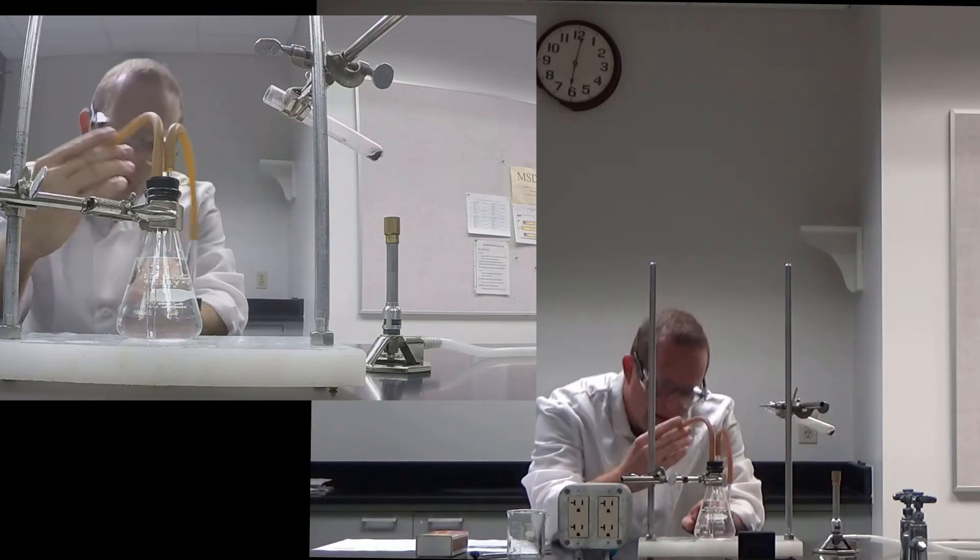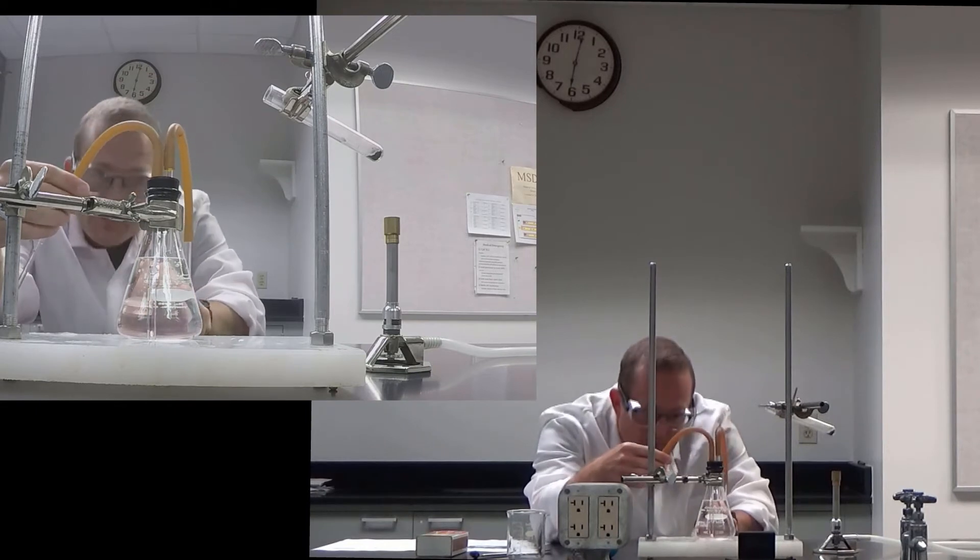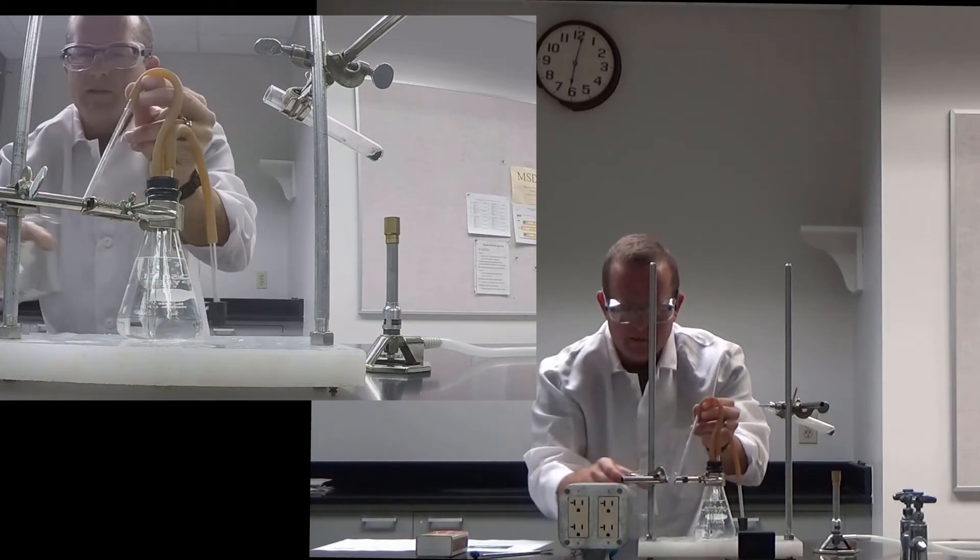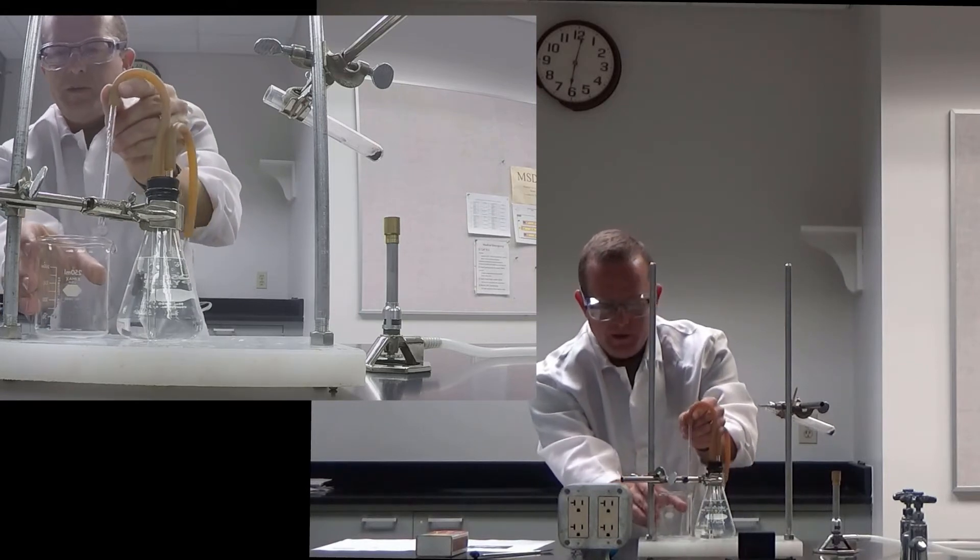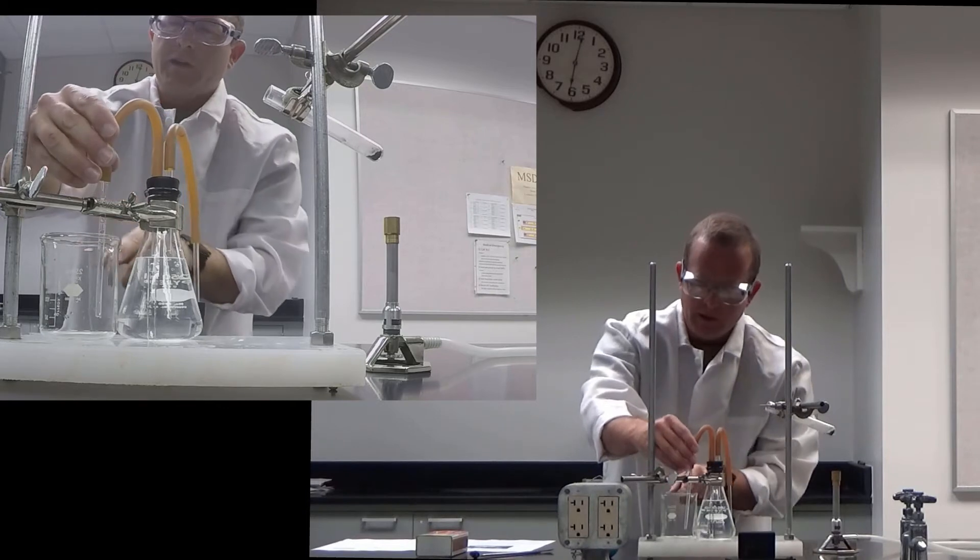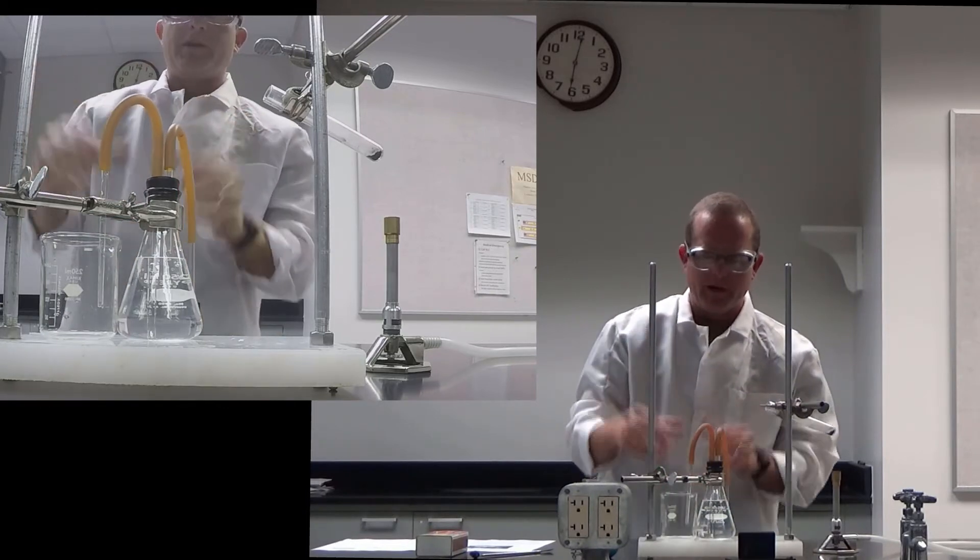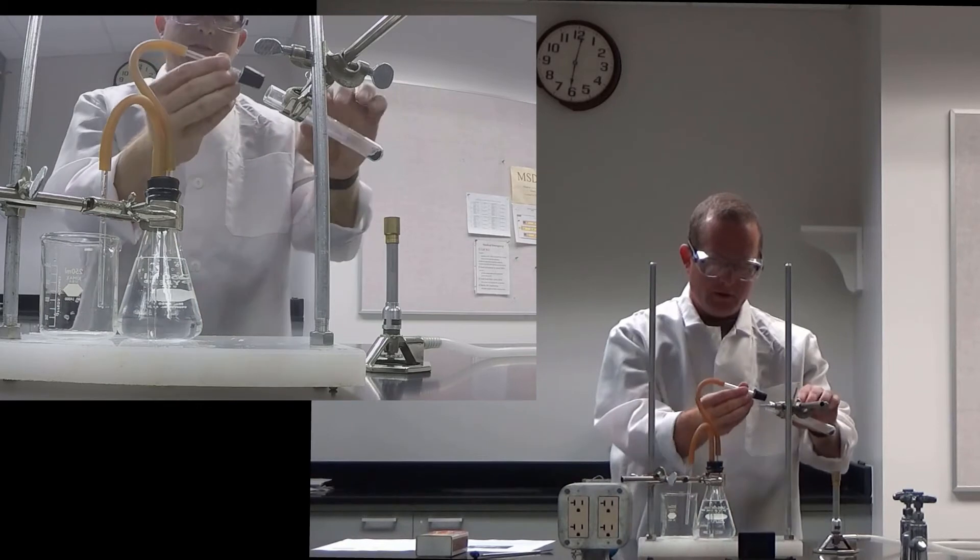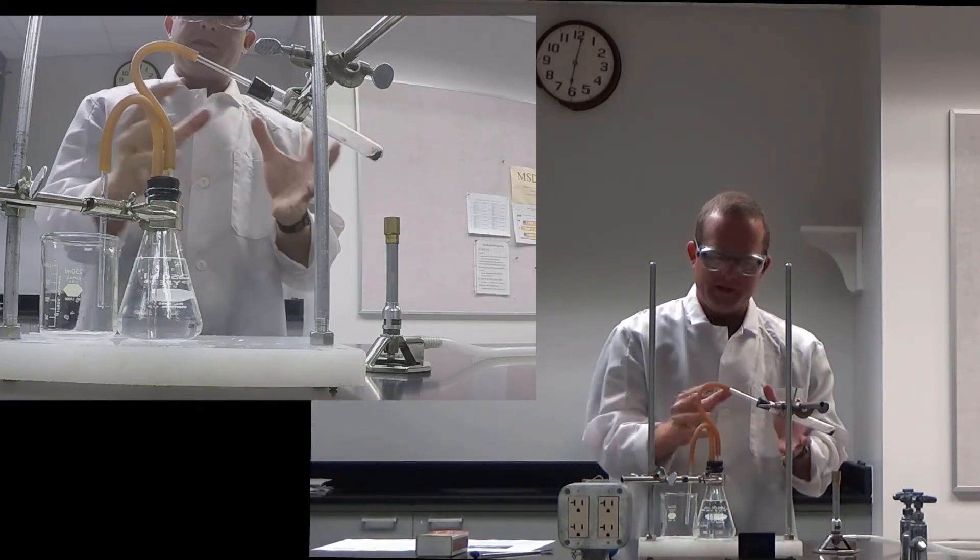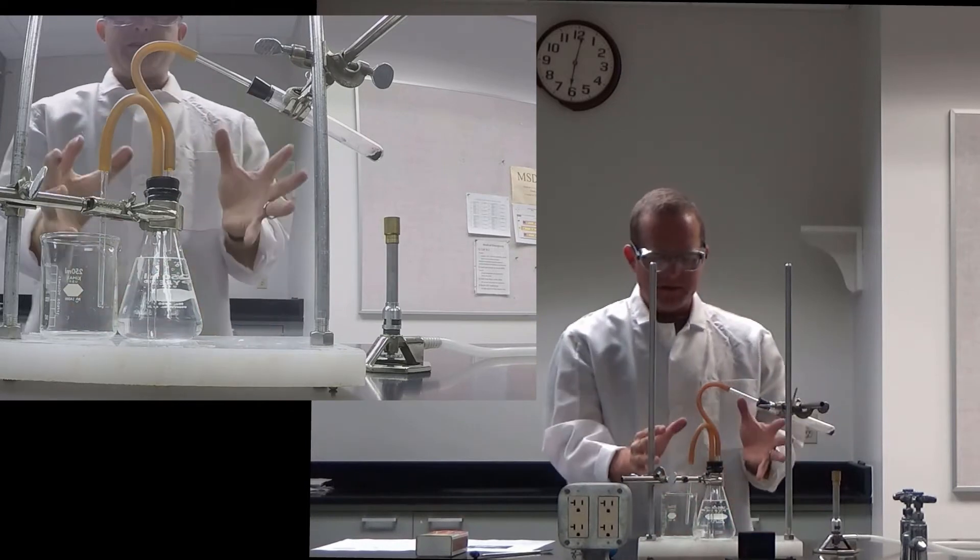So we'll place our Erlenmeyer in its holder. And very important, the longer tube, the one that goes down to the bottom of the Erlenmeyer, is our exit tube. So that tube has to be placed in this beaker here. And I'm just going to put it within the clamp here so it can be held secure and it won't flop around. This little guy will go here with the rubber stopper to make a seal for the whole system. So now the system is sealed.